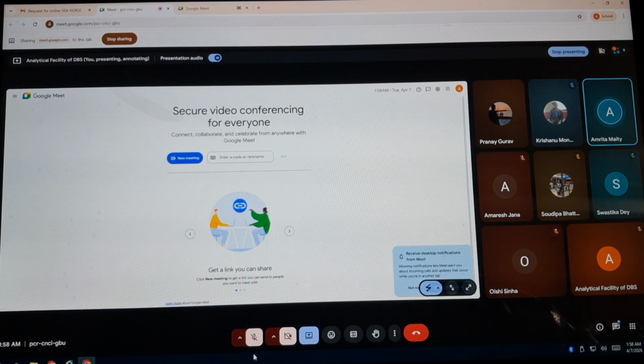Sir, we are also working with bacterial cells, so I have prepared a short presentation from the available papers regarding how to adhere them. Can I send it to you? Yes, sir, do share. Okay, fine. I will give it a look. Can you give us some guidelines on how to optimize it a little? Yes, sure. Thank you so much. We can do that.